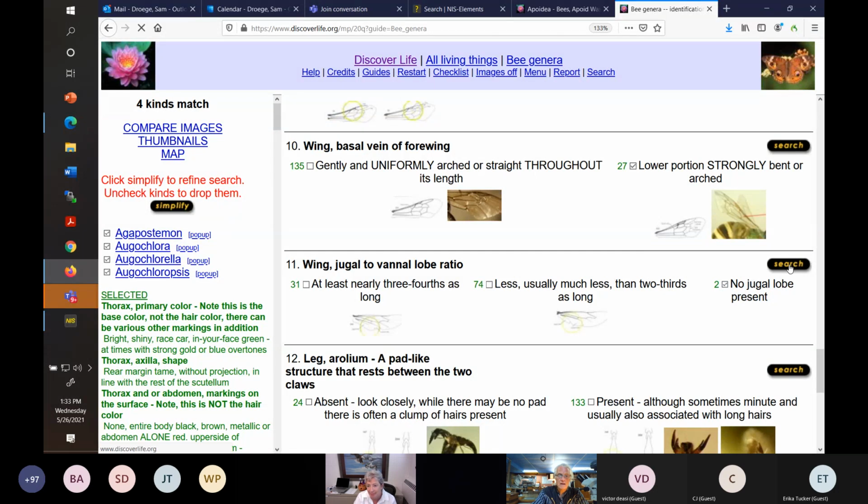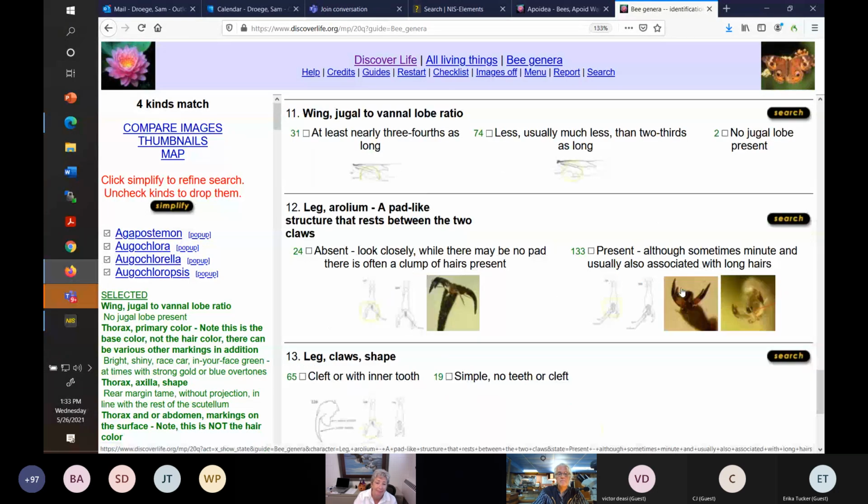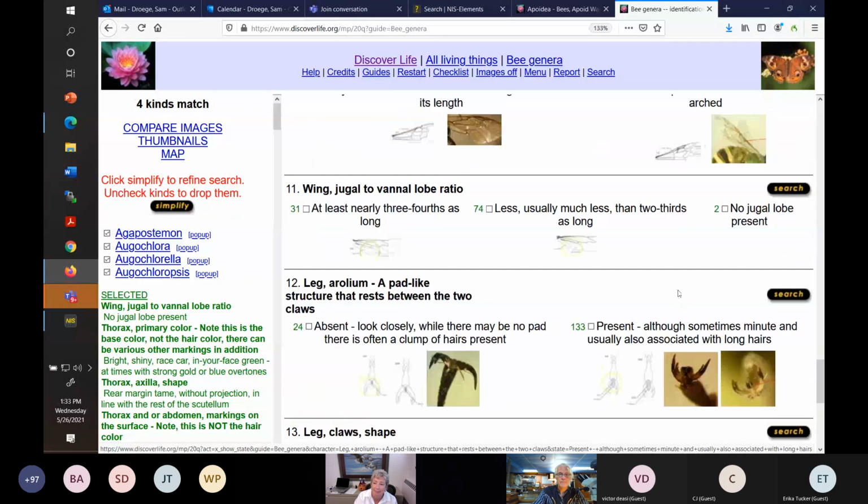So when I click on that, it should say there are no species that have that situation. I'll have to investigate, but something is messed up there, because that should have created a zeroing out of all these species.